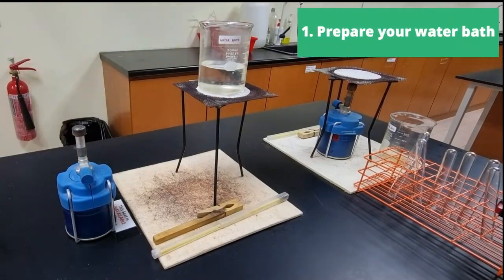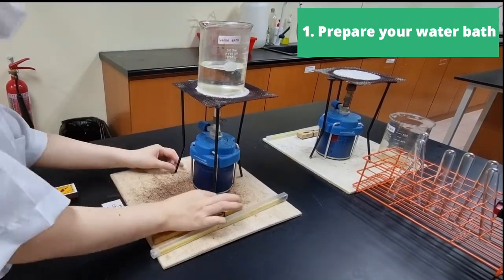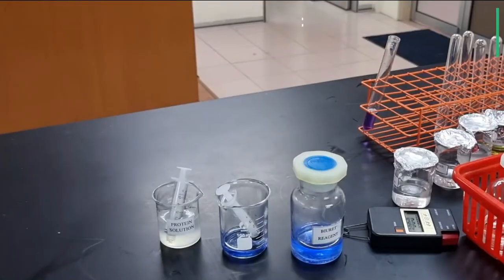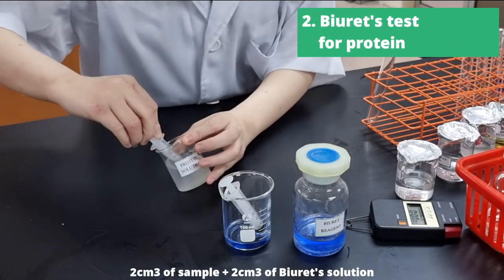Hello everyone and welcome to biological tests. The first thing we will always do, even during exams, is to prepare a water bath. Water takes really long to boil, especially in an air-conditioned environment, so make sure to do that first.